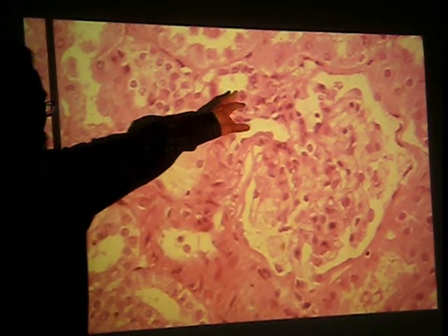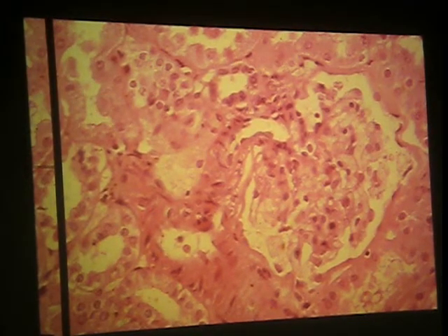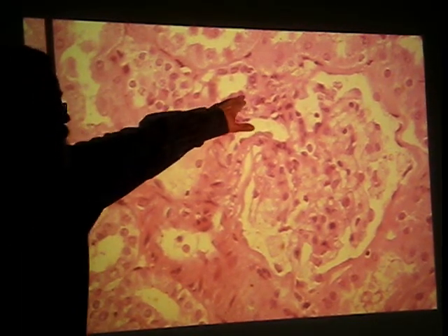If you take the time, even at 4x, looking at your kidney slides, scanning a bunch of renal corpuscles, you might come up with something like this. How do you know that's the macula densa versus just a regular tubule? The nuclear density, that dense spot. The nuclei of the cuboidal cells are crammed right next to one another.